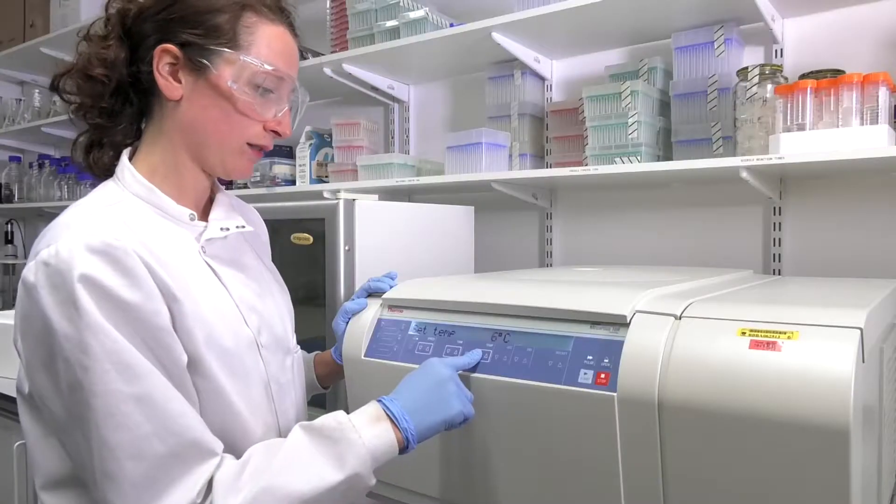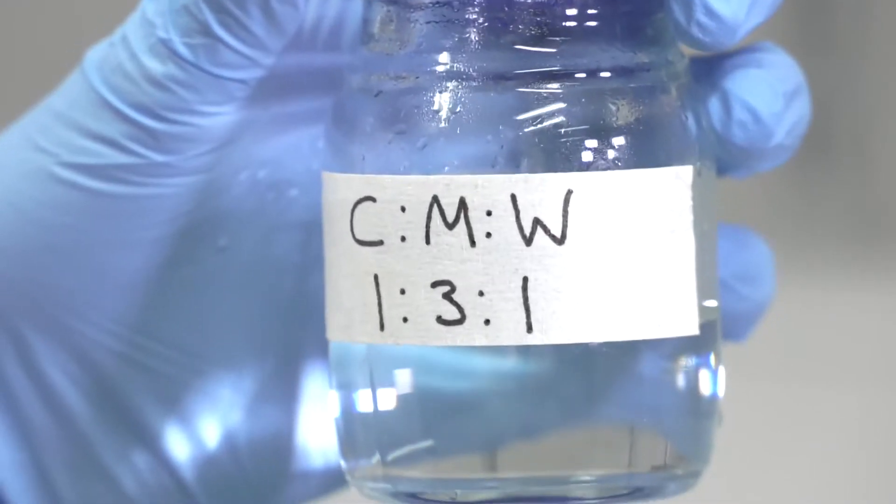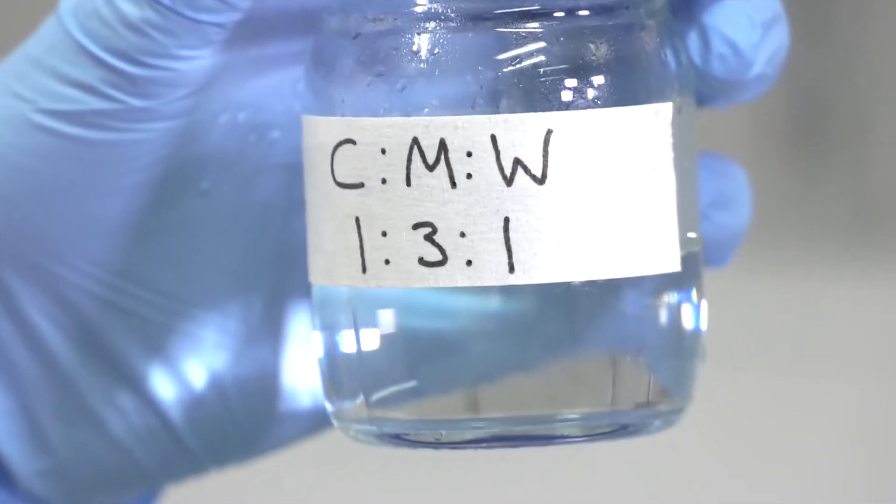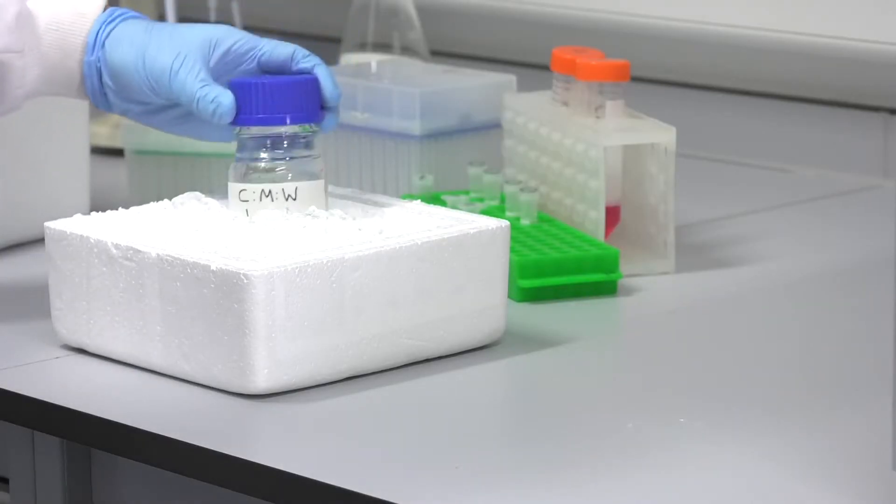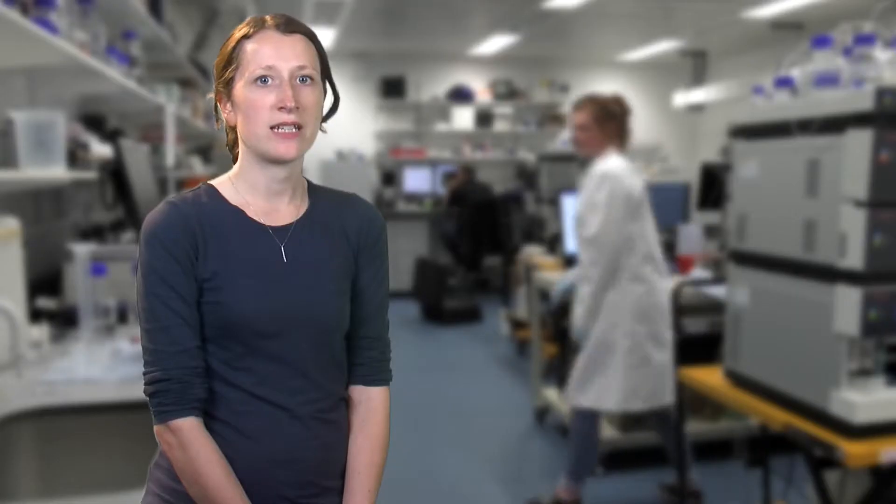Before we start extracting the samples, we need to prepare our equipment. Cool the centrifuges to 4 degrees C. Prepare the solvent, usually chloroform, methanol water, in the ratio 1 to 3 to 1 and place in an ice bath. If your samples need rapid cooling or freeze-thaw cycles, prepare a dry ice ethanol bath. Now we are ready to start.